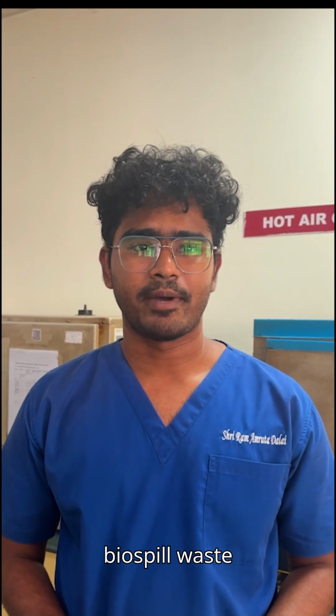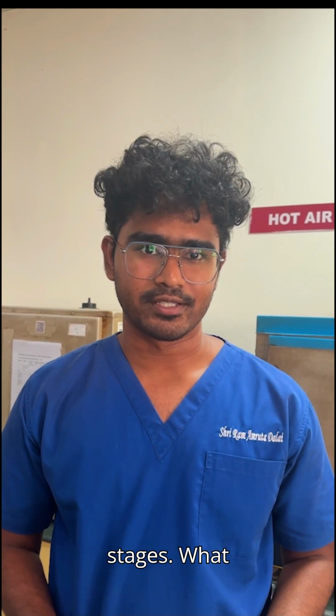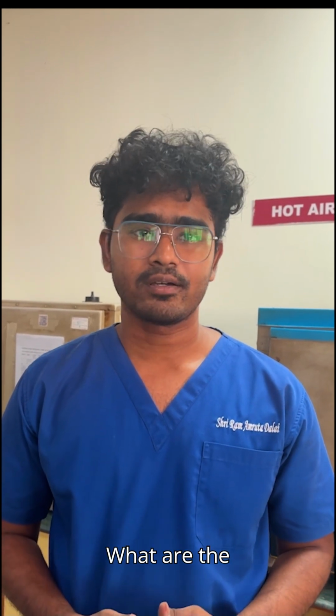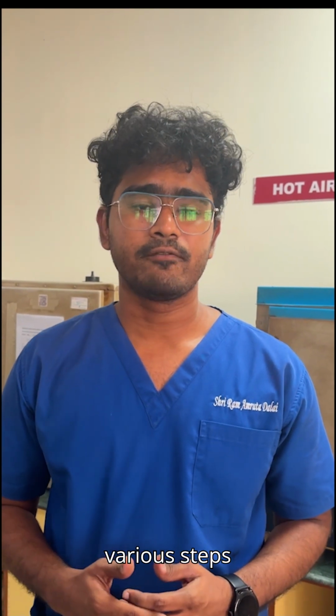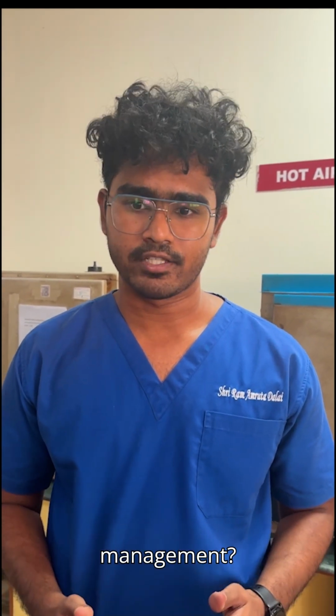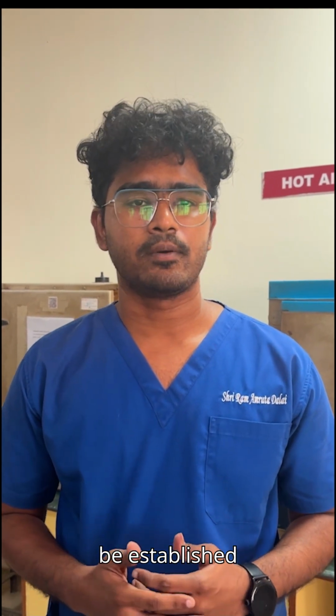Today we had a session on biospill waste management. This is like a training module. We have explained it in 4 stages: What is a biospill? What are the types of biospill? What does a biospill contain? Then what are the various steps in biospill waste management? This should be strictly followed and accidents must be reported. Future training programs can be established later.